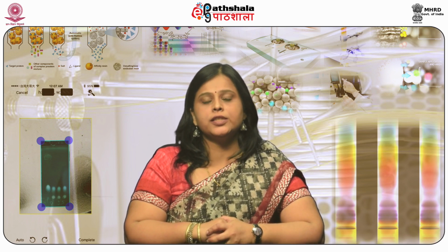The first use of a supercritical fluid as mobile phase was described by Klesper and Turner in 1962. However, the technique did not gain much importance till 1982, when the first commercial instrument for supercritical chromatography was introduced by Hewlett-Packard. Advancement in instrumentation continued thereafter. New applications were explored in the 1980s. In 1986, Lee Scientific developed capillary columns for supercritical fluid chromatography. Further innovations in instrumentation were carried out during the following years.